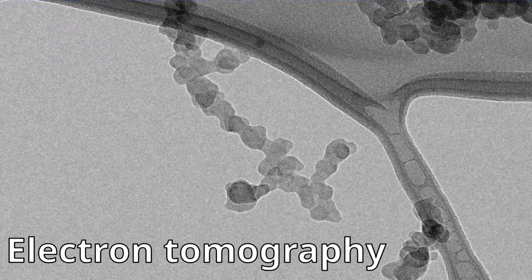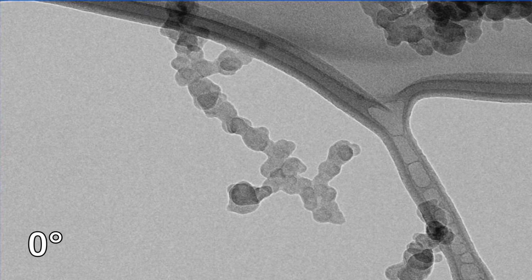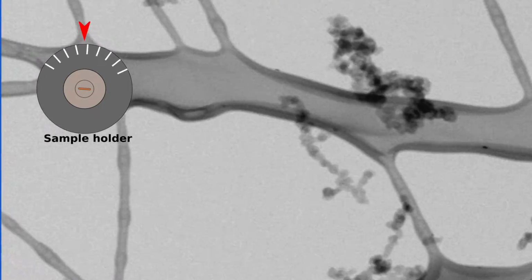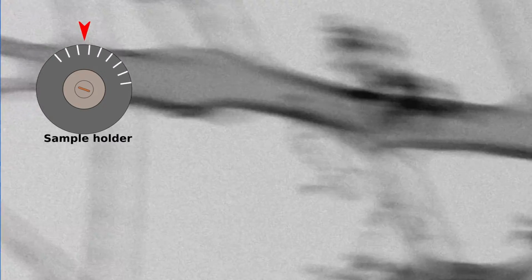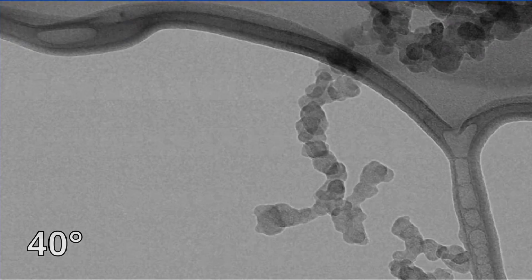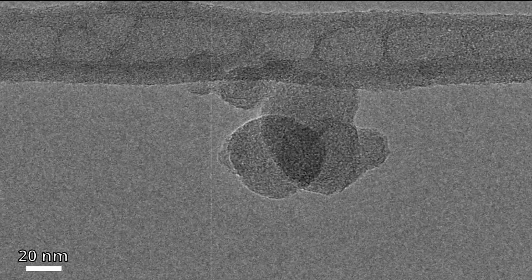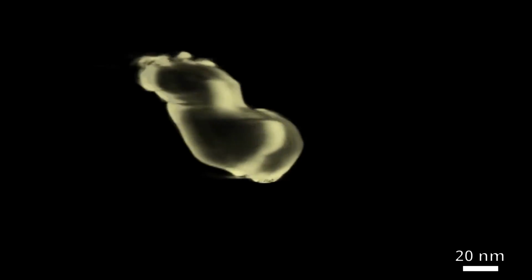An interesting use case of TEM is 3D tomography. The shape of the analyzed particle can be reconstructed from a series of images taken for different tilt angles of the sample holder. This results in a big collection of images of the same particle. The information about the shape of the particle is extracted from the image series. The data is then interpolated and extrapolated to create a 3D model of the particle.